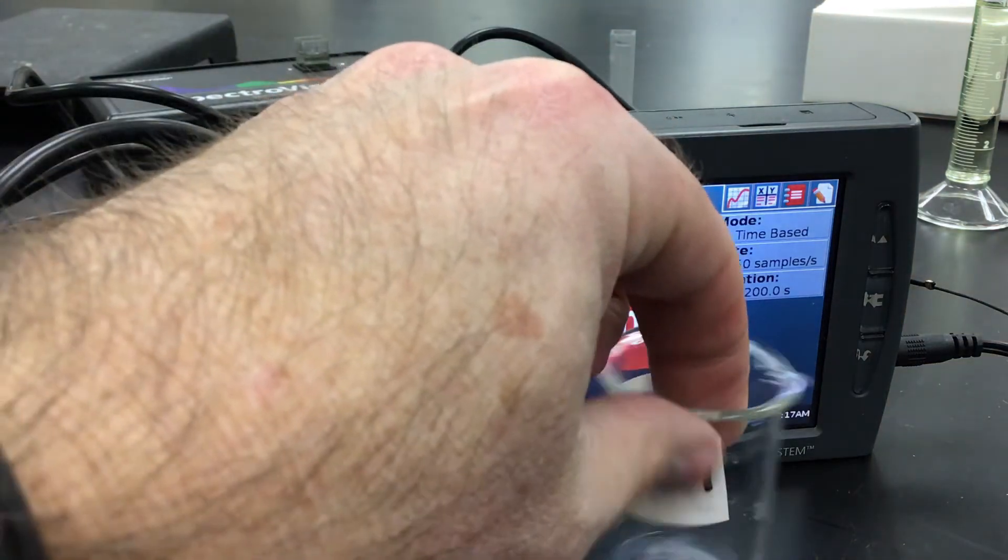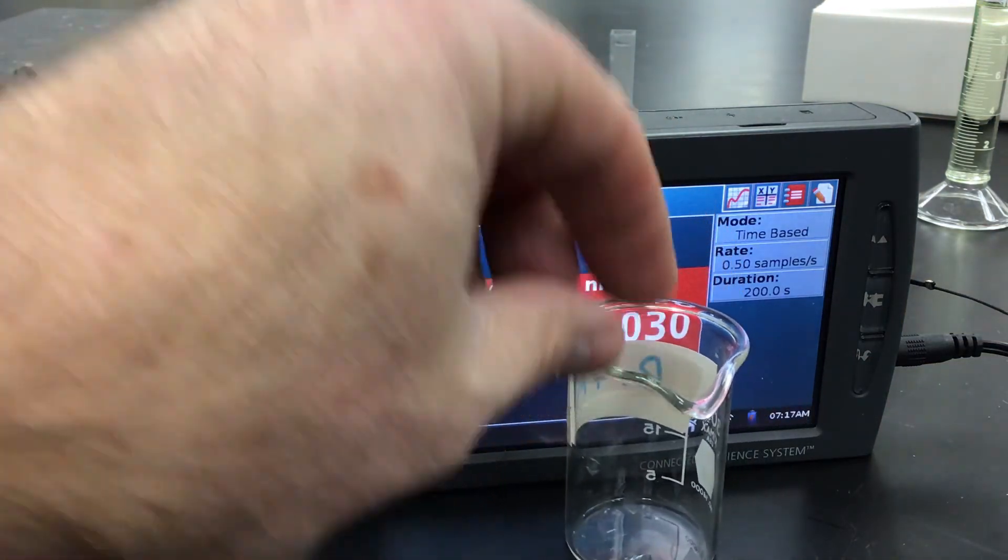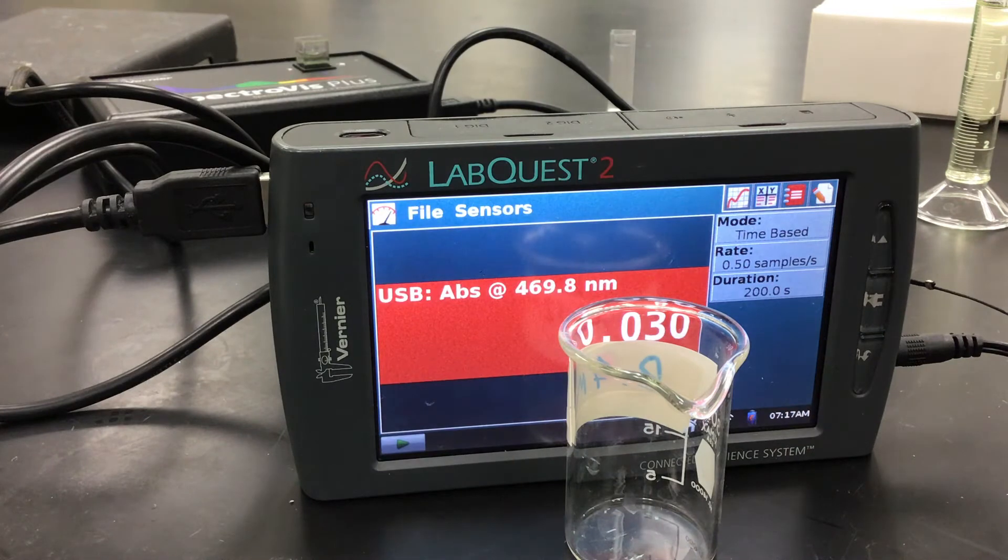This is not the concentration of it. This is just an old label. And what we're going to do is we want to sort of, when we collect our three trials, we want to do this in terms of mixing and then putting our solutions into the cuvette around the same time and try to be as consistent as we can.